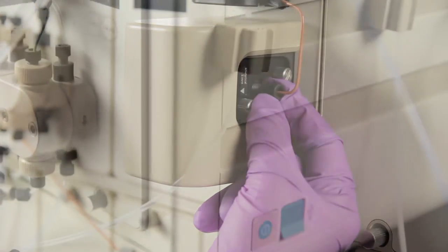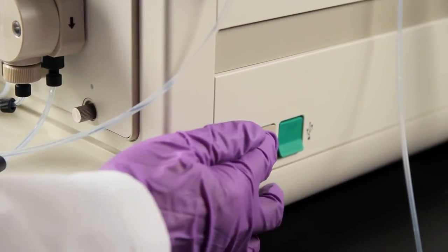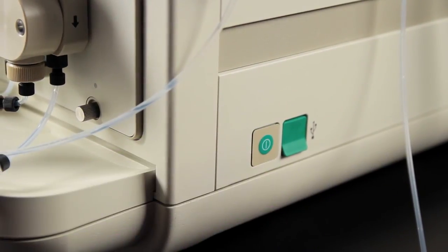Reconnect the tubing lines to the conductivity monitor and restart the NGC instrument. Your flow cell should now be free of bubbles and ready for your next run. If you have other questions about your NGC or any of your Bio-Rad products, please write to us at support at Bio-Rad dot com.